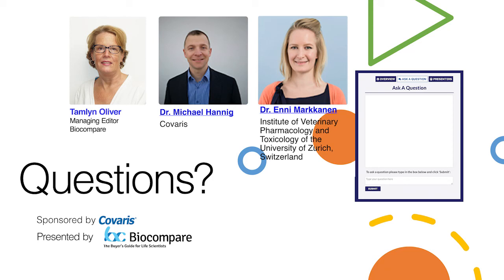But this is really, if you have a pathology lab at your disposal and you give them the specifics, and you can find all of the specifics in the papers that were mentioned in the presentation, really in the materials and methods section, this is really not something extremely difficult. We have had several pathology labs, depending on where the samples come from, performing this workflow for us, and it has never been a problem.